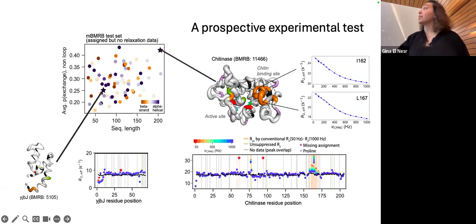Similarly, we take this protein, it's a hypothetical protein from one of the genomic studies, and it has very little predicted dynamics from Dyna1. And the NMR relaxation CPMG experiment shows that there's no dynamics happening there. And so we were very pleased to see the experimental data match up roughly with the values we were seeing from our test set. And so I think someone asked earlier, is this a good assumption? And so this is the assumption we have.